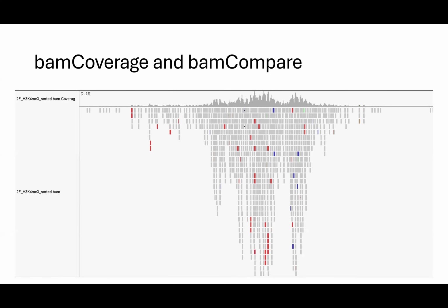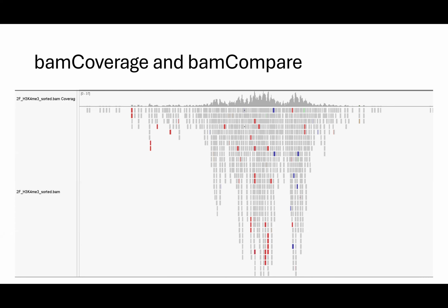So again, just to visually show coverage, the reads look something like this, where they're just piled up, and the coverage is just sort of this score for each part. One big advantage is that this data is a lot smaller than the original data, because here we had every single read and what the sequence was and what the reference is supposed to be, and there's a lot of information, also quality information on the sequencing. If you just cut it down to coverage, you just have at each genomic location some sort of score, usually between 0 and 100. So this makes things very much smaller data-wise. It makes it a lot easier to move forward.